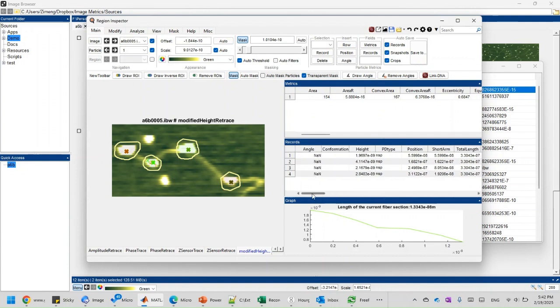I also have my protein DNA type, and all these are non-specific. This is calculated, like I said, from the short arm fraction. Here we have the short arm fraction, that's 16%, 49%, 24%, and 5%. This is all way beyond the 39% for my specific site, which should be around 39%. So that's not within plus or minus 5% of 39%. That's why they're not specific complexes. They're called non-specific complexes, and that's labeled for us here.